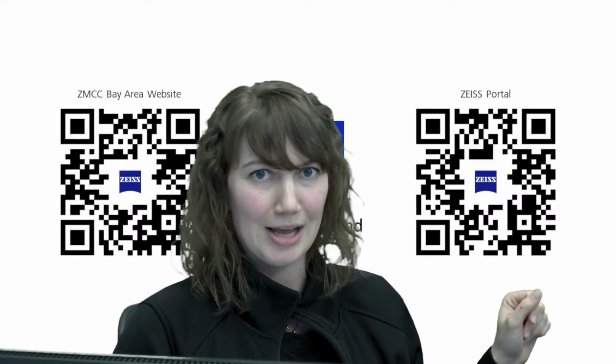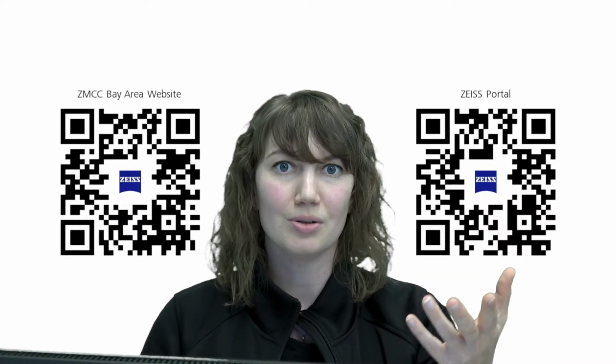I don't have it right now to plop into the chat. I don't know if my other application scientist who's sitting behind me might be able to do a quick Google and find that and plop it in the chat for you. But we do have publications on that. And of course, if you are interested and want to get your hands on that, you can reach out to your local ZEISS rep and they'll be able to pull that up and send you all that info as well.